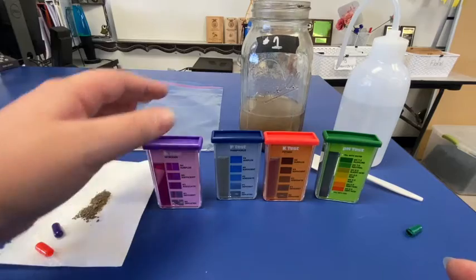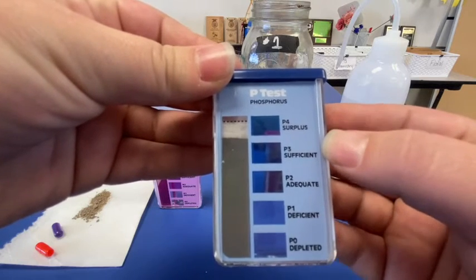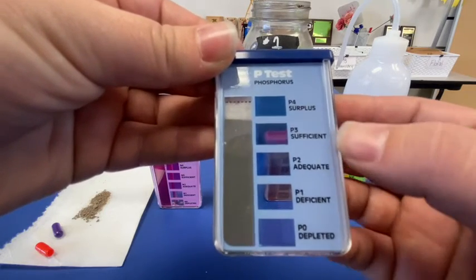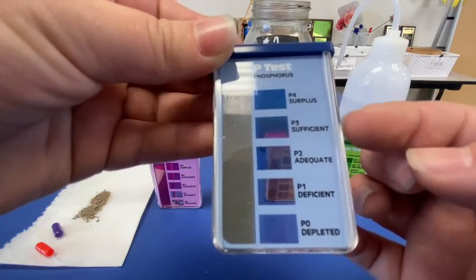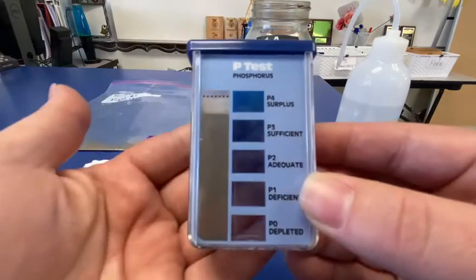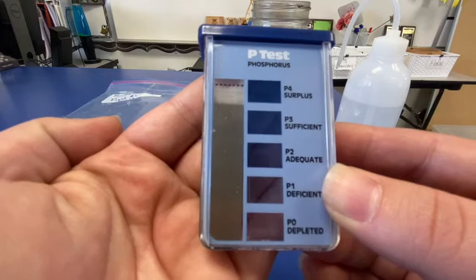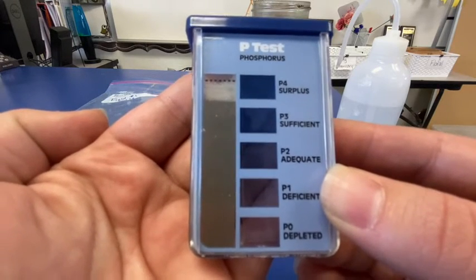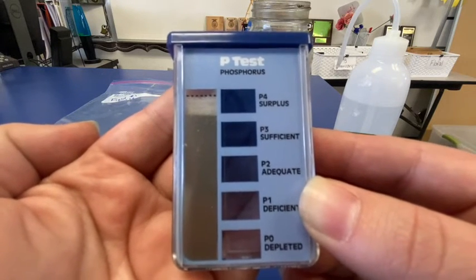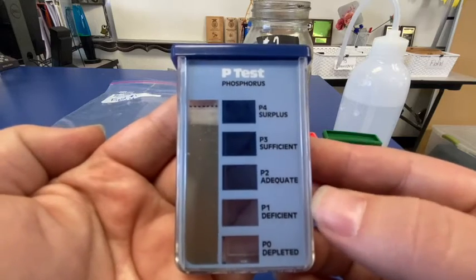Moving on to our phosphorus test. This is set up the same way. We have P4 — surplus, P3 — sufficient, P2 — adequate, P1 — deficient, and P0 — depleted. What that means is that phosphorus is either too much, a good amount, or not enough for that soil to be fully healthy and provide proper plant nutrients. I'll put my hand behind here so you can see the difference. On your slides, highlight what you think this phosphorus test result is for field number one. What color does it best match?